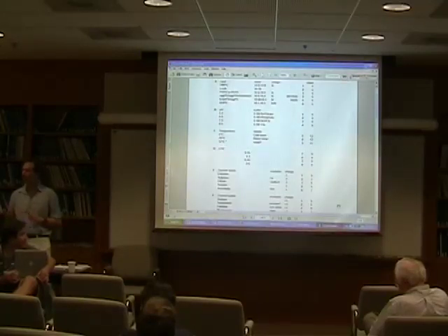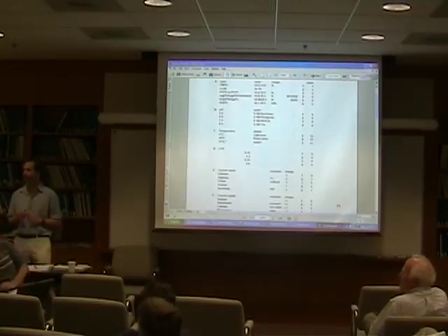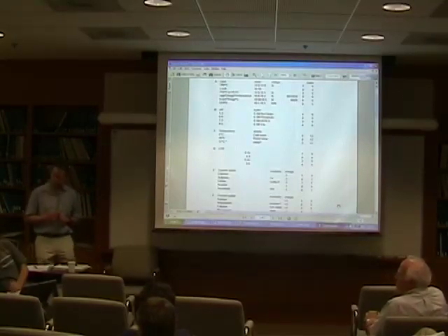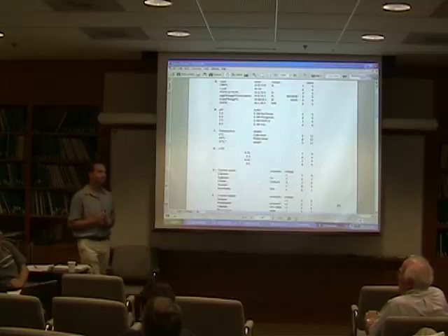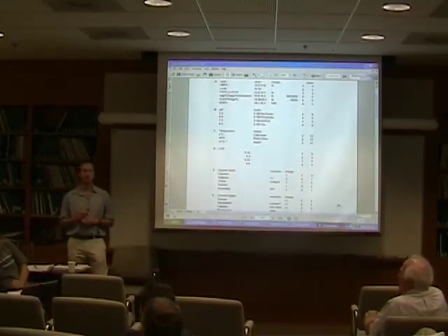So what do we think would be too many screens? What would be the right number of screens? I mean, it really depends if you have a lot of protein, and sometimes getting 12 conditions together is difficult. But it also depends how big you make the sample. I mean, what are the conditions that people are working with?